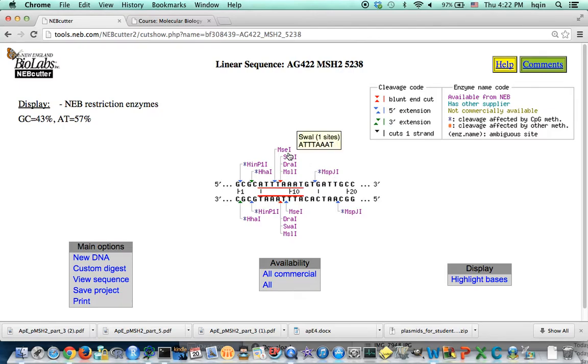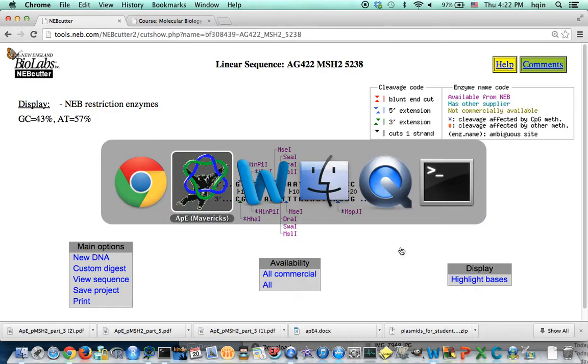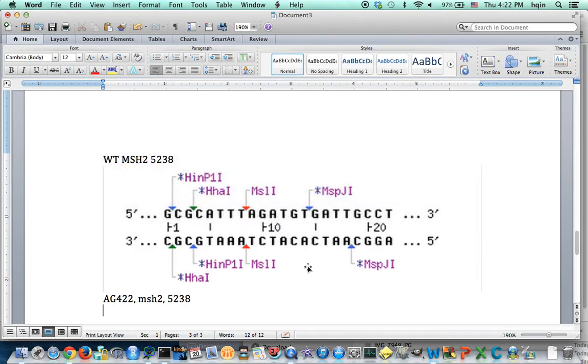And let's save the screen again. Go back to my Word document.